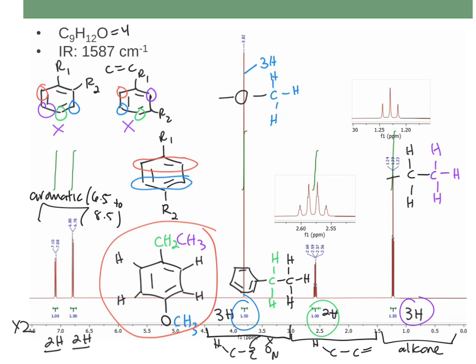Now, not everything you'll be able to figure out given just an NMR. You'll need other things like carbon-13 NMR or mass spectroscopy or your IR. So you'll have to combine all of these so that you know what you have. And that's how science works. That's how we figure out brand new molecules that have never been made before, is doing this exactly.